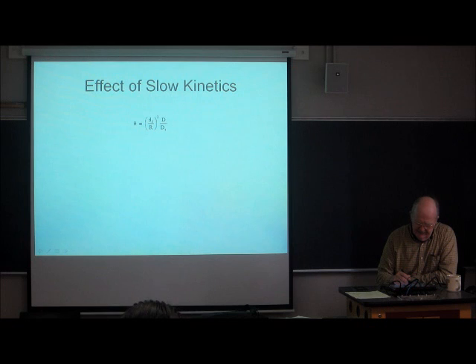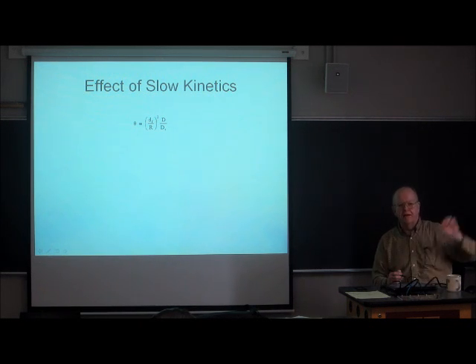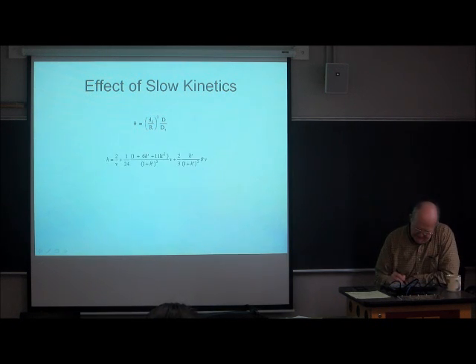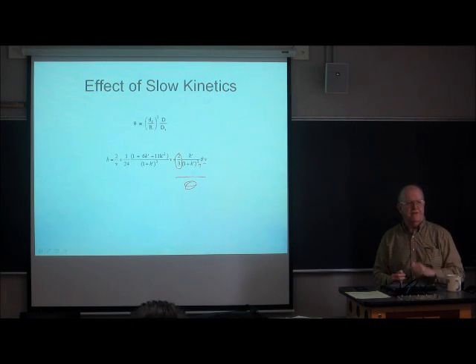I'm going to define theta as the ratio of the film thickness to the radius of the capillary, that ratio squared, times the diffusion coefficient in the mobile phase divided by the diffusion coefficient in the stationary phase. So I'm going to plug that into the previous equation, and I get 2/3 k prime over (1 plus k prime) squared times theta times the reduced velocity. So this term depends upon theta, which is effectively a reduced film thickness.